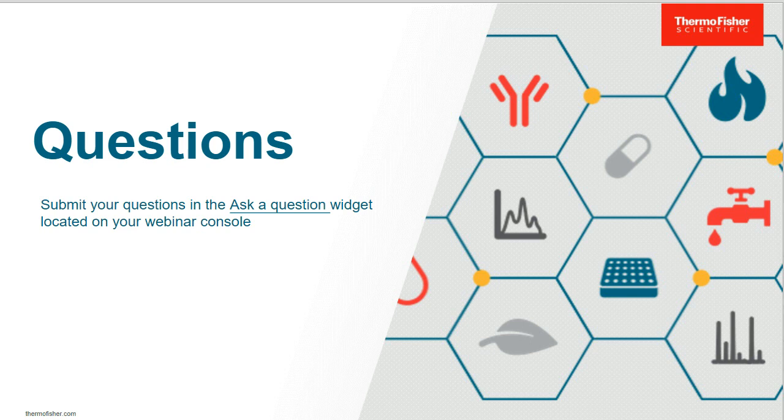Maybe this one is for you, Santosh. What is your recommendation for DIA workflow setup for small sample sets, maybe around 30 to 50 samples? Hi. So this is a very important question, because in DIA studies, the sample sets always determine how long you want to run, and also the availability of the mass spectrometer system that you might have.